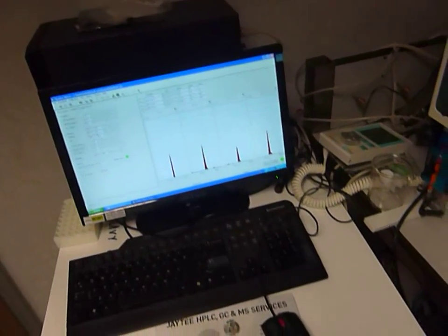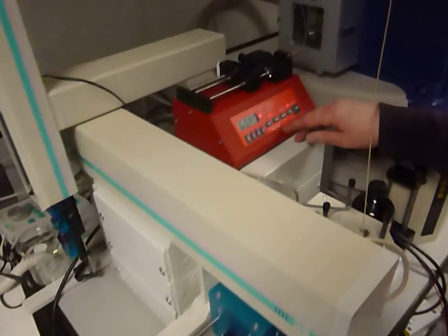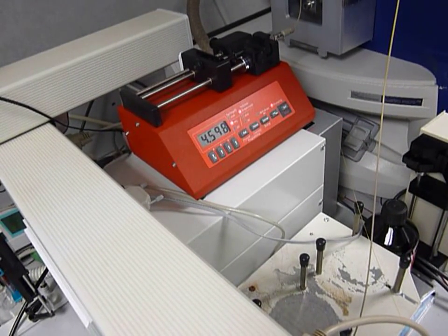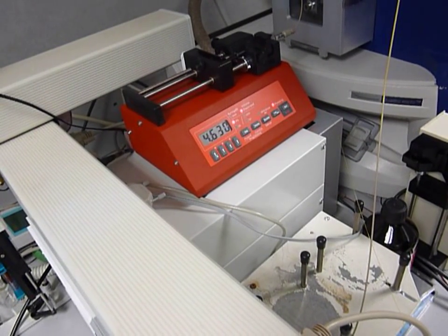And then also, you can check what volume you've dispensed by pressing volume twice. This is the actual volume that's actually going into the mass spectrometer.